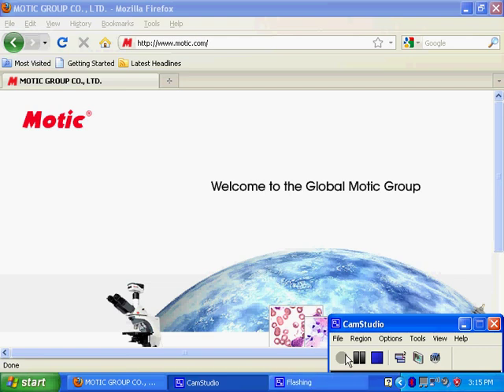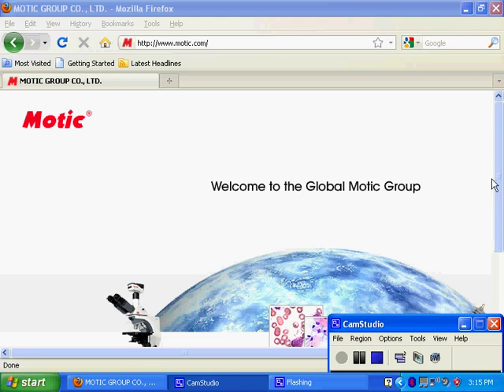This is a how-to guide on how to install the correct driver for your Moticam or your Microscope Motic product. If you do not have the software CD that came with your Moticam or Microscope product, please go to www.motic.com and download the new software.